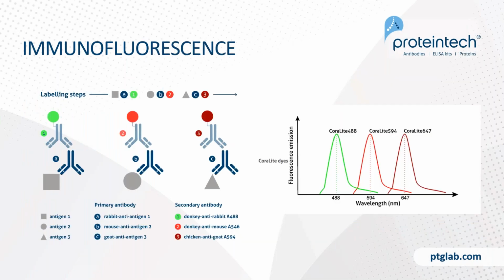The basic premise behind immunofluorescence is where an antibody binds to the desired antigen in your tissue or cells. After this, we can then add a secondary antibody, which is specific to the host which the primary antibody was raised in. This secondary antibody will then bind to that primary antibody, and it is labeled with a fluorophore. This fluorophore will emit light at a specific wavelength. IF is special because you can then have multiple different fluorophores within the same slide.